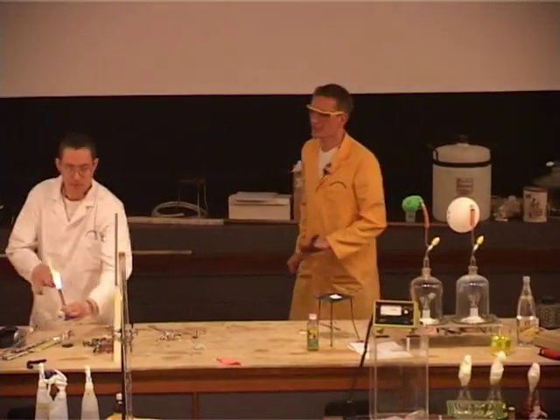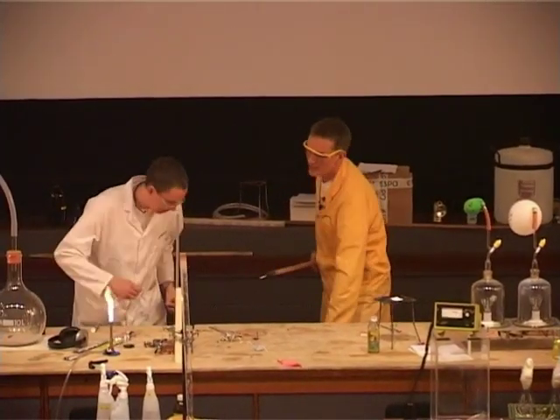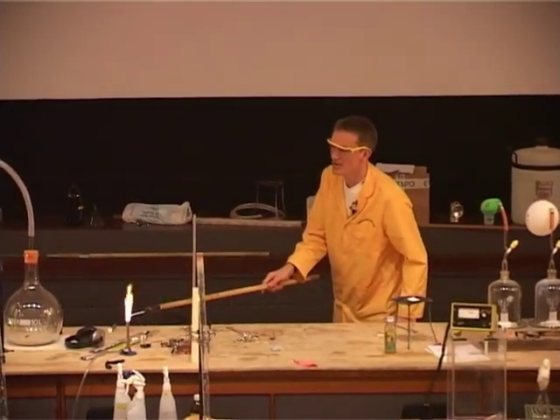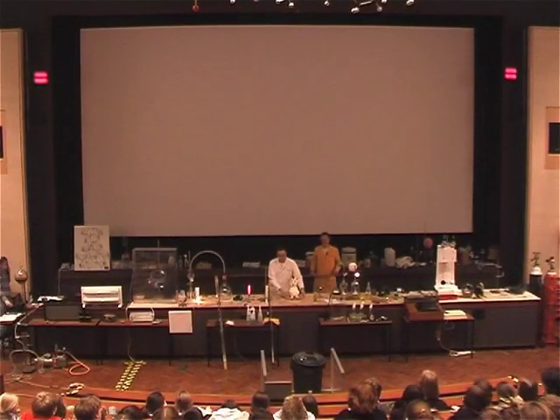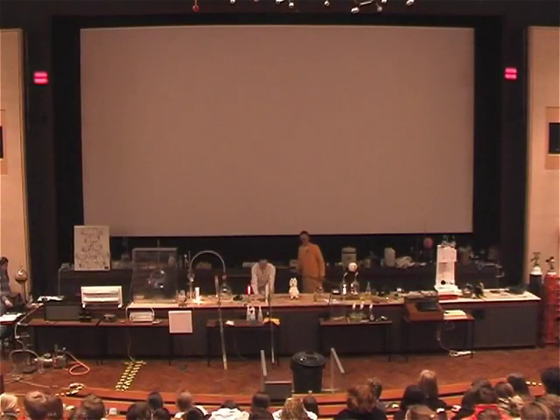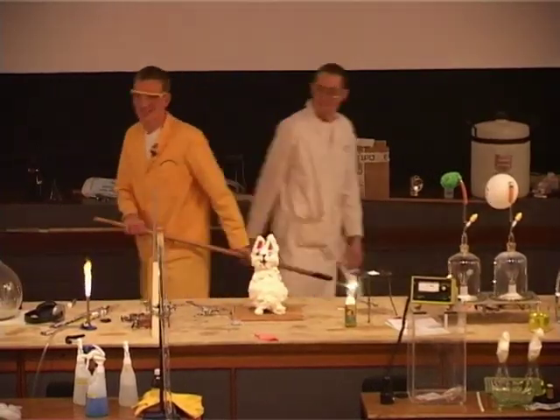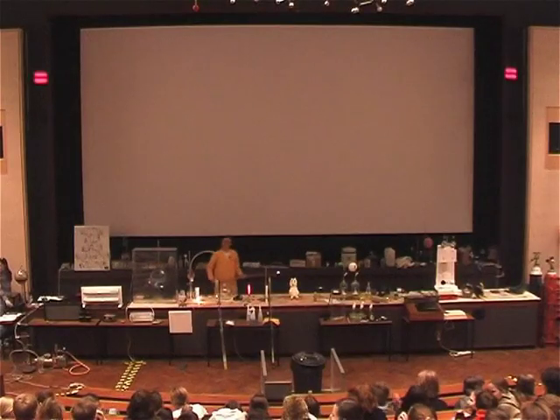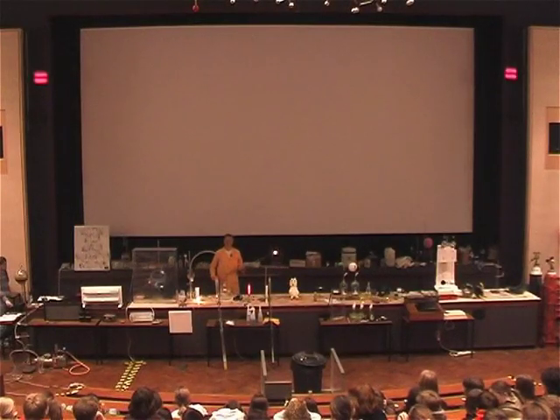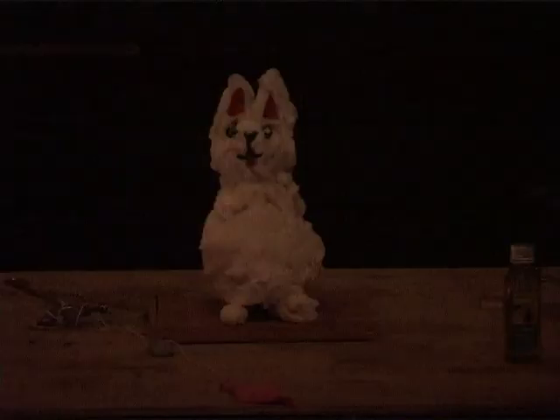Well, we have one more example to show you, and this is our little bunny rabbit. It's made of something called nitrocellulose, okay, or gun cotton. He's very cute. So what do you think? Should we convert him into light? Yes, I think so. Okay, so here he goes.